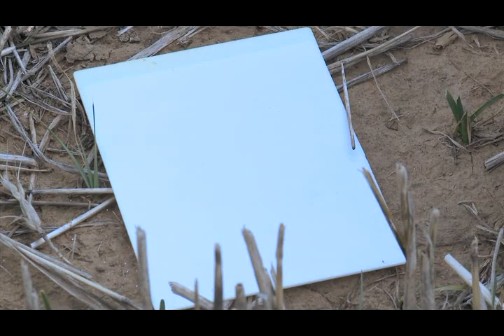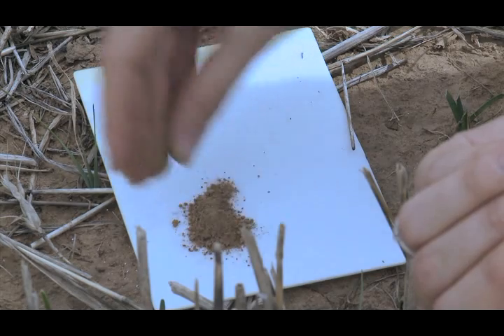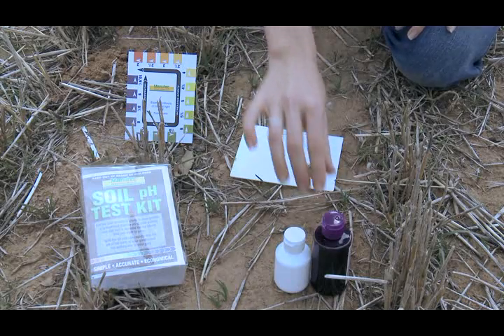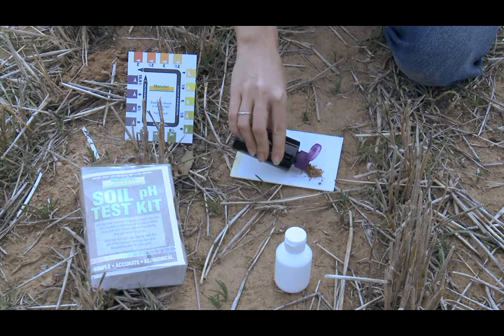Step 1: Collect a small amount of soil from the sampling area. Step 2: Place soil on the white test plate provided. Step 3: Add 3 to 5 drops of indicator liquid to the soil.